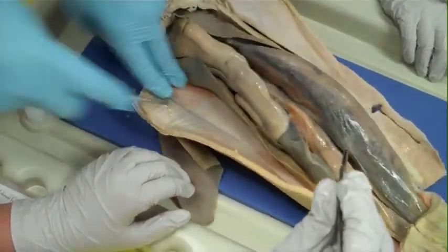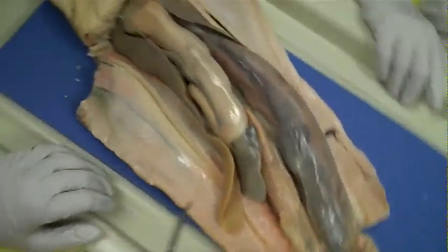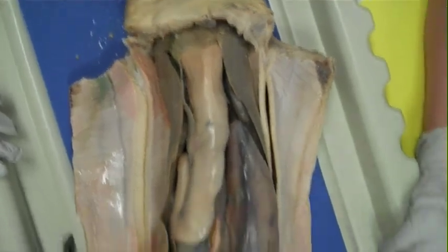When you're cutting through the bigger ones, there's a lot of cartilage too. Now we are open and ready to observe.